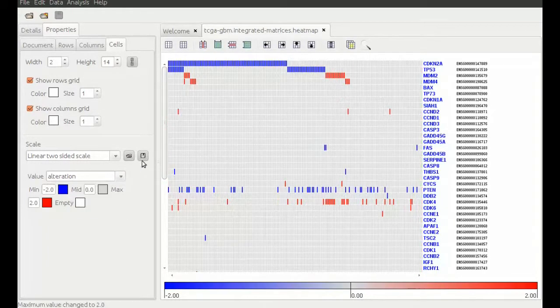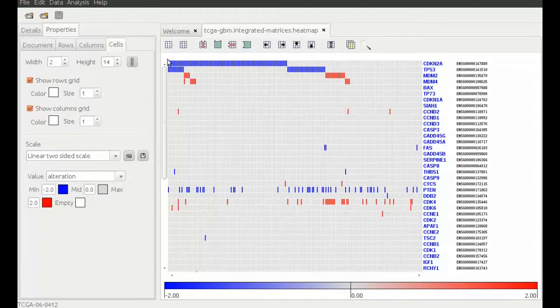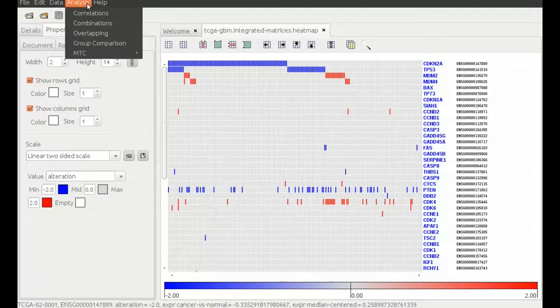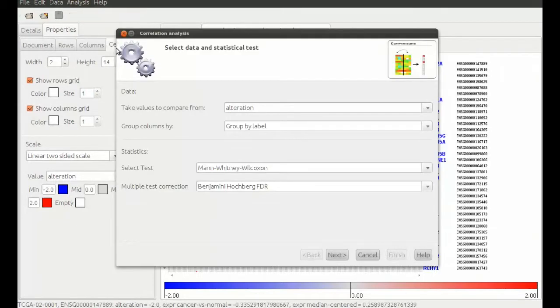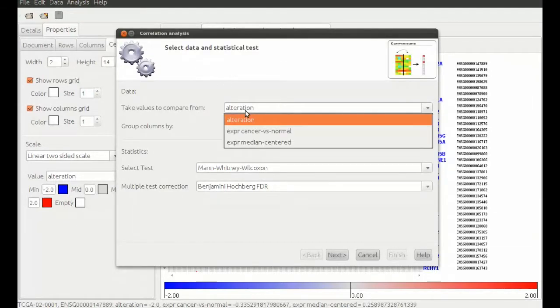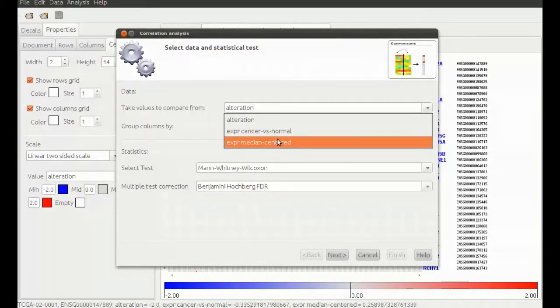But if we want to be sure we can make a group comparison analysis to perform a statistical test that backs up our observation. With this analysis we can assess if values of two groups are statistically different.